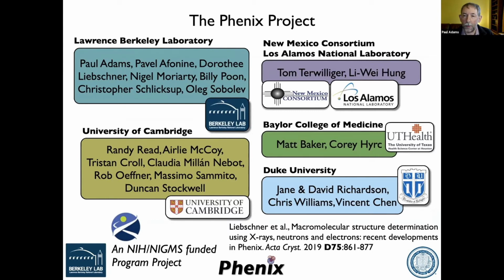Nigel mentioned that particular residue. But that's normally because they don't know what the sequence is, or they can't register it properly, so they don't have a reference model at a high resolution. So those models do exist, but if you actually have basically the same protein structure from somewhere, as I said, you can be fairly confident the side chains are there. They haven't disappeared.